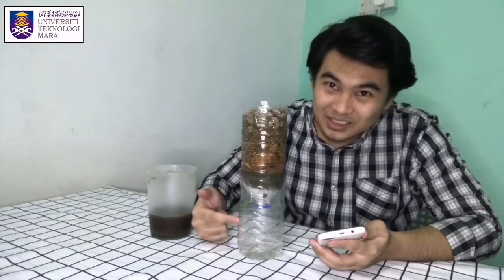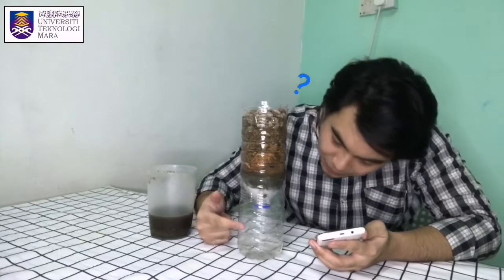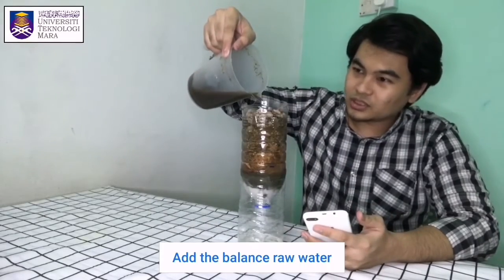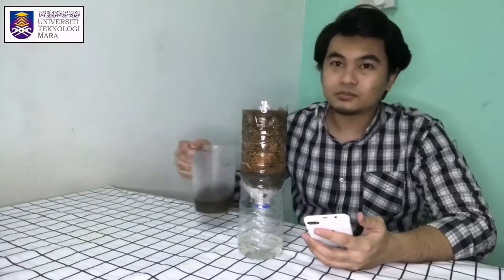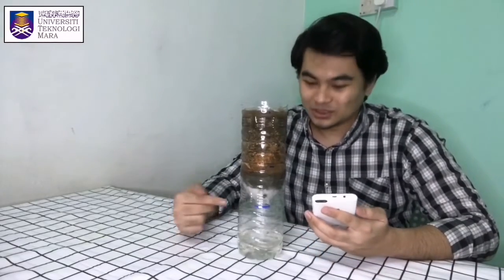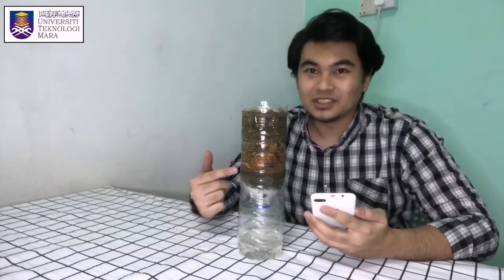You can see the water start filtering. Add more water. Wait until the water finish to filter.